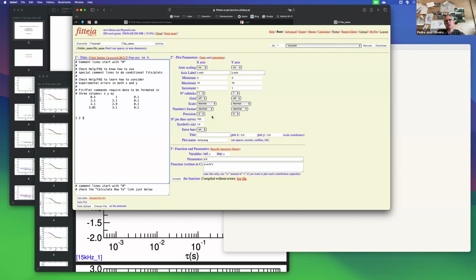Of course, in a graphical interface, most of these settings are somehow hidden, because if you want to choose how, for instance, the axis here looks like, you just click on the line, and the line opens a menu, and on that menu you'll find this type of settings to choose from.